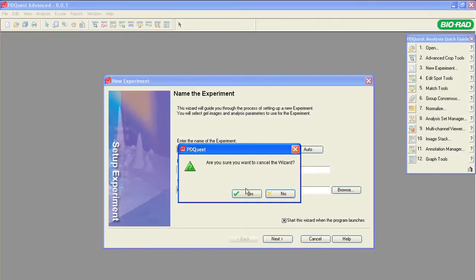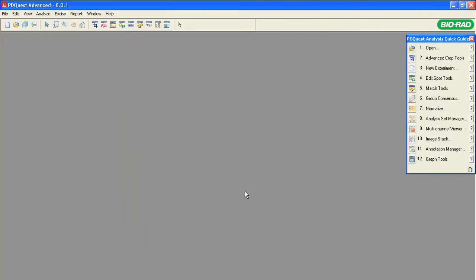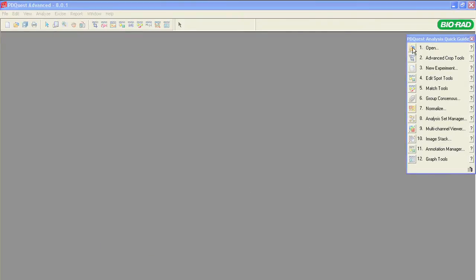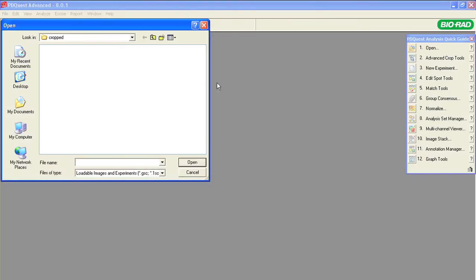To begin, close the experiment wizard and use the quick guide. The quick guide is a useful tool that displays all the essential functions in a single location.